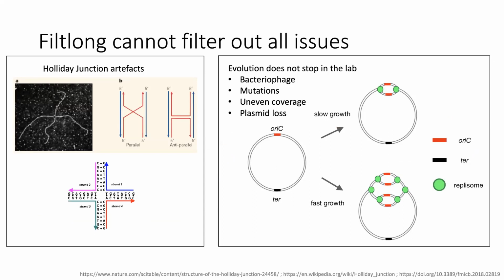If anybody asks you why your sequencing failed, just start throwing Holliday junctions and other jargon at them. And eventually they'll just decide that you know what you're doing and let you go on your way. Those are portions of the DNA that they've broken and they haven't repaired adequately. So it's not a linear strand of DNA anymore.